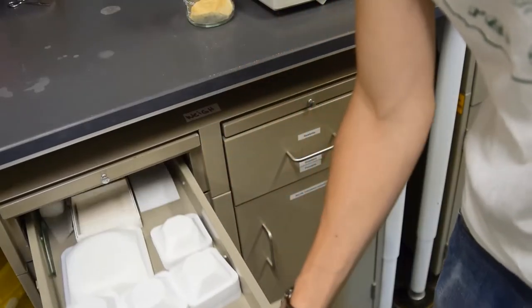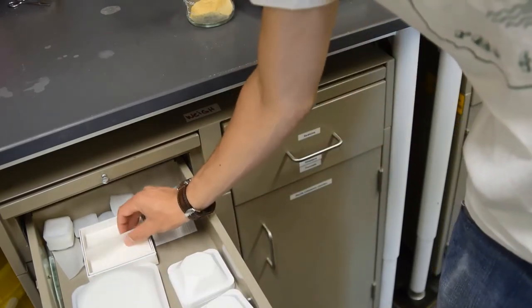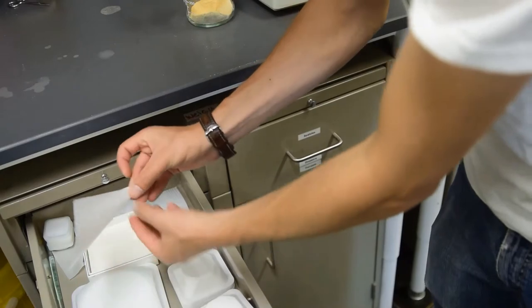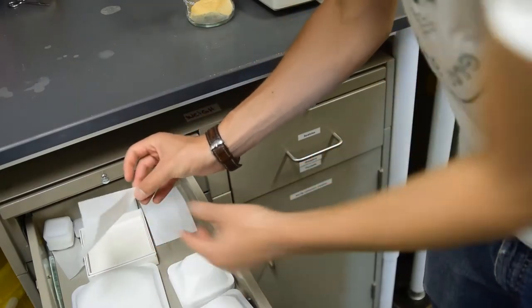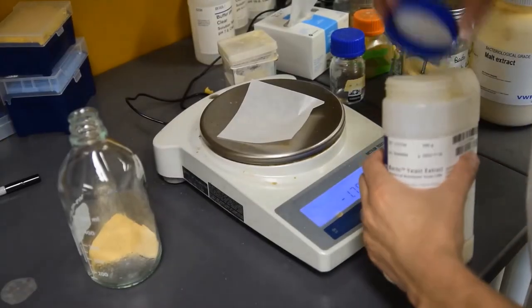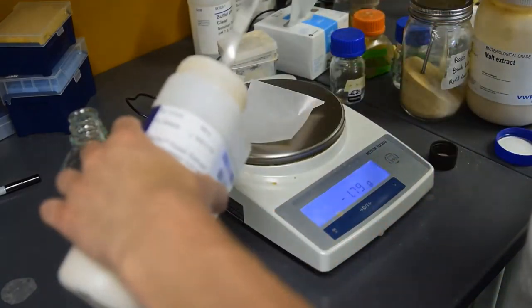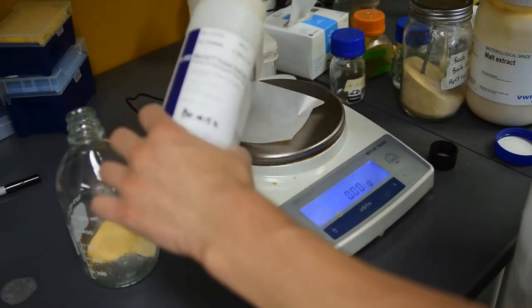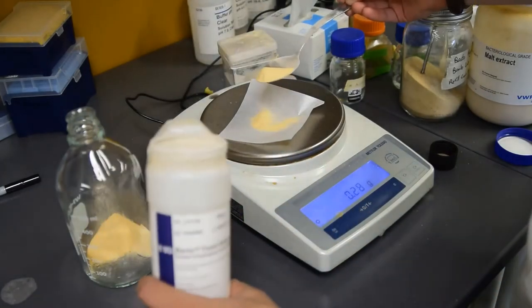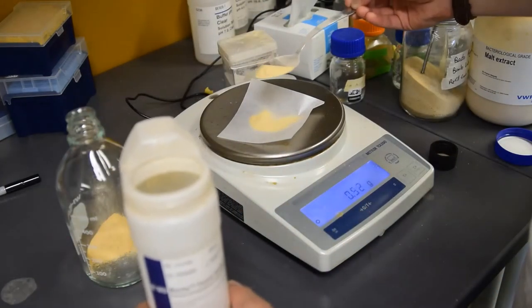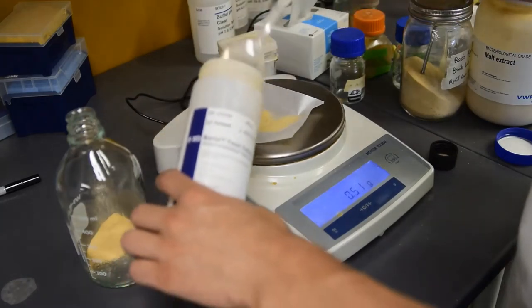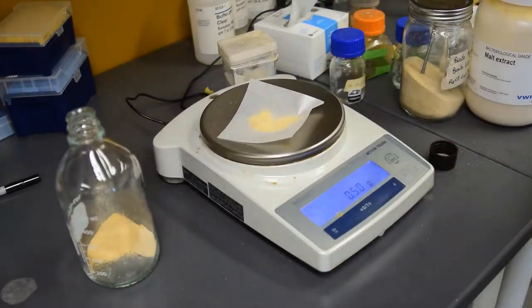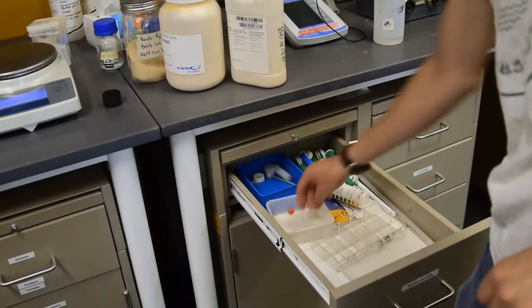Now for the yeast extract, we are going to use a weighing paper because it is a smaller amount. I like to pinch the corner to make it easier to handle. Remember to tare your scale. It's okay to put a little bit back in the container, especially if you're using a clean weighing dish or paper.